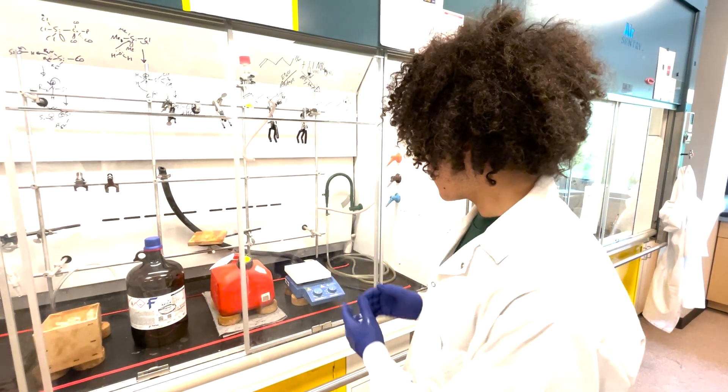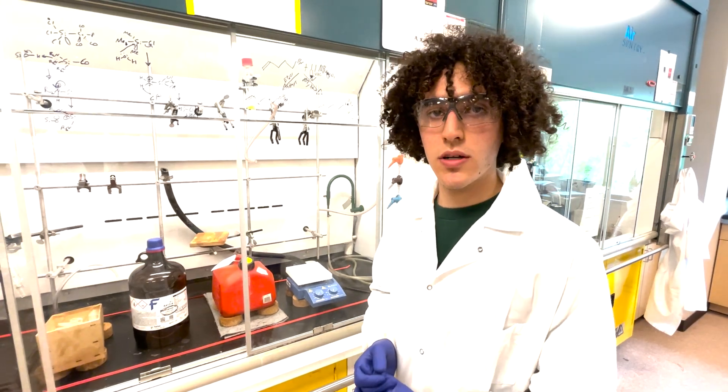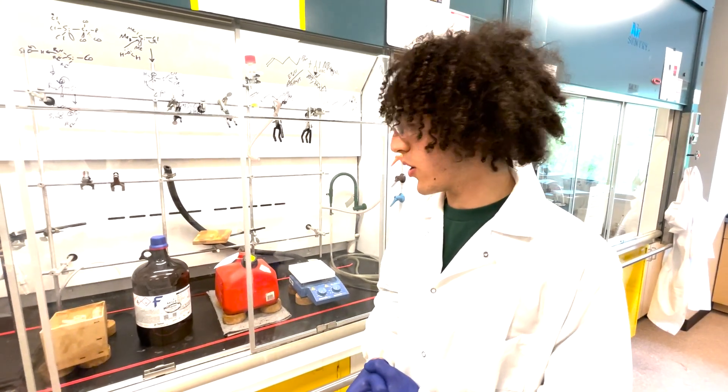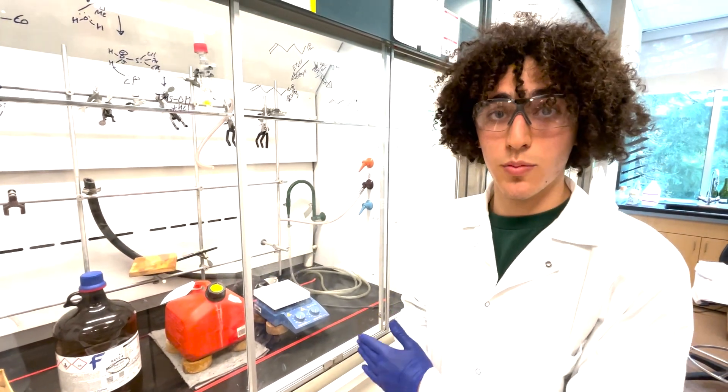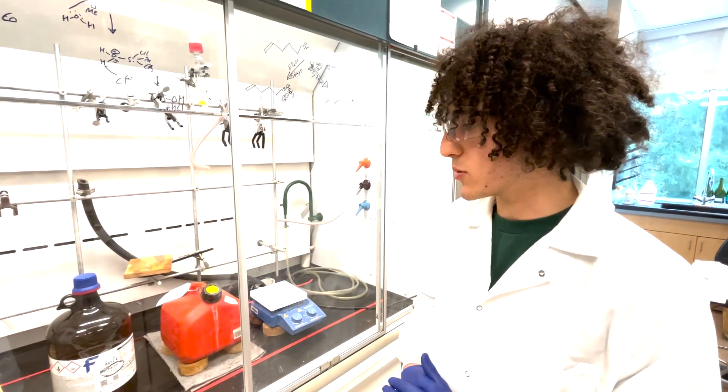Another consideration is the type of equipment being used in the fume hood with respect to the experiment that is ongoing. We do not want unapproved electrical equipment or ignition sources in the fume hood when there are flammable vapors present.